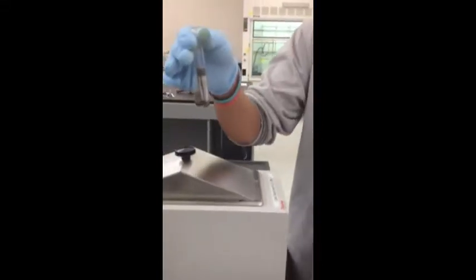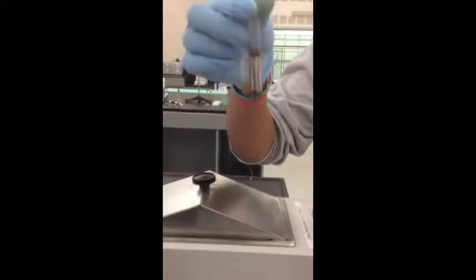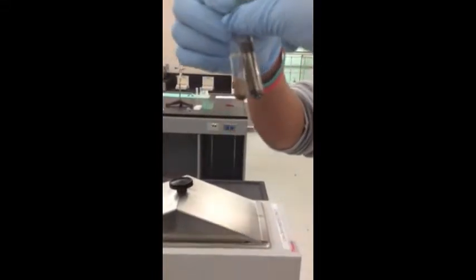After 10 minutes in the water bath, a positive test results in a mirror-like coating on the walls of the test tube. If negative, it indicates a ketone. Aldehydes give a positive result; ketones give a negative result.